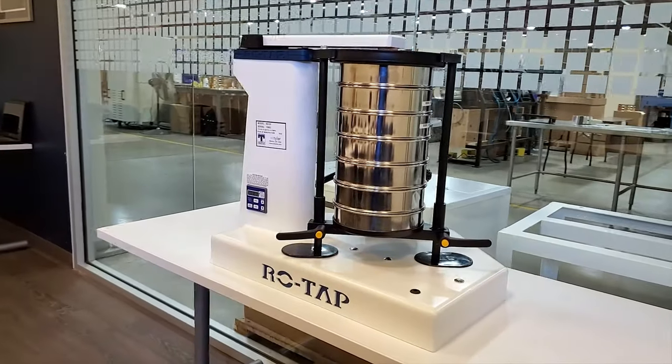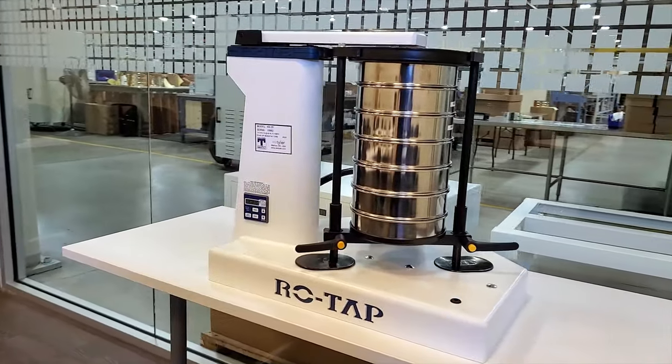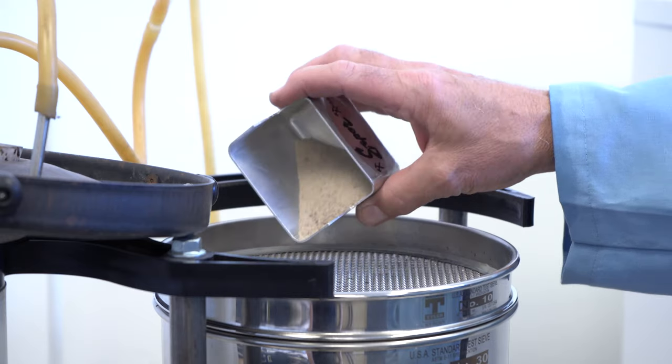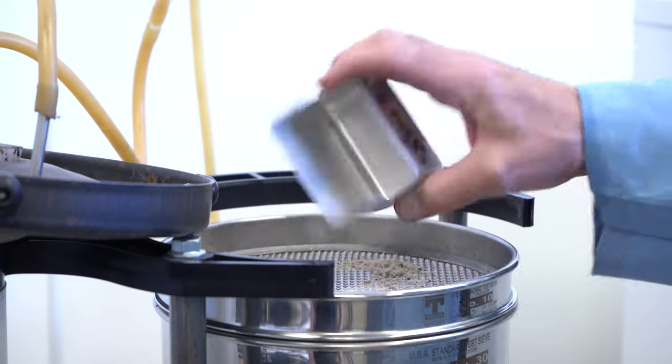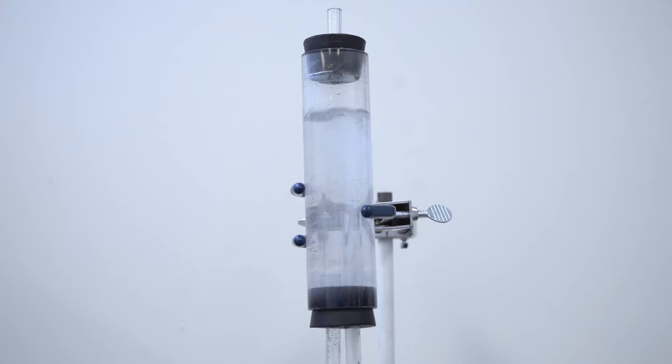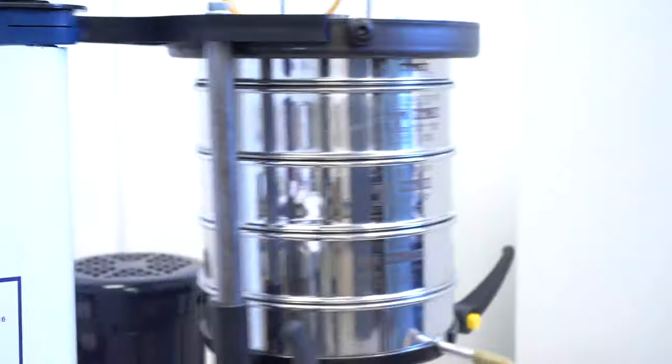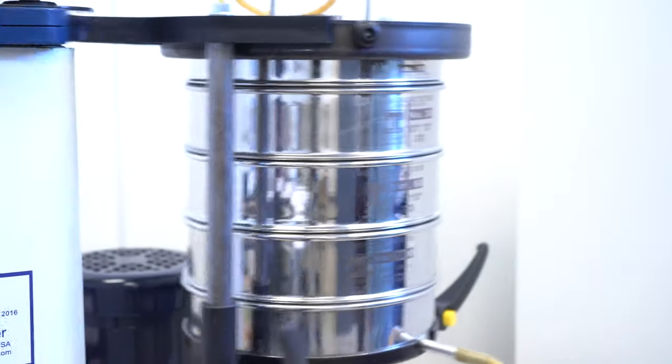Assemble the wet test kit on a conventional RX 29 ROTAP. Deposit the dried sample material on the top test sieve. Slowly turn on the water source to ensure that no water leaks out the side of the sieves. Set the timer to your desired test time and turn on the ROTAP. When the test is complete allow the water to drip out of the drain pan.